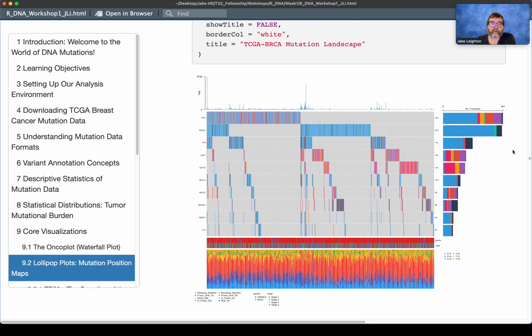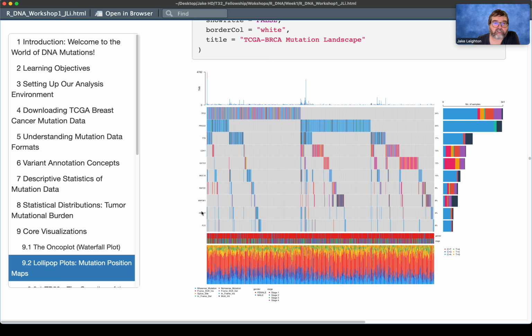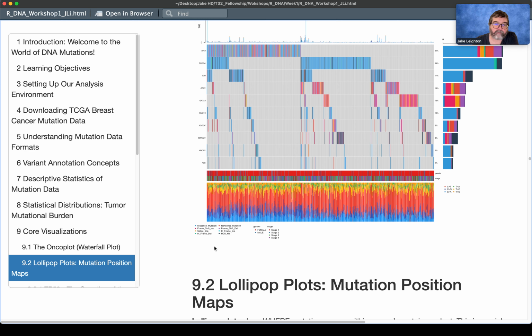And look what we got here. We got a bunch of new stuff. We still have our 10 genes. We have all our mutations like normal. We have our positions, our distribution of types here, and that came from the same legend, just different colors now. And we have our two new tracks: gender along here, and age and stage along here. They're mainly female, and stages kind of change up. I think they would cluster better if they were real, right? And then we have this really cool track here, which is really the mutation patterns for each patient.